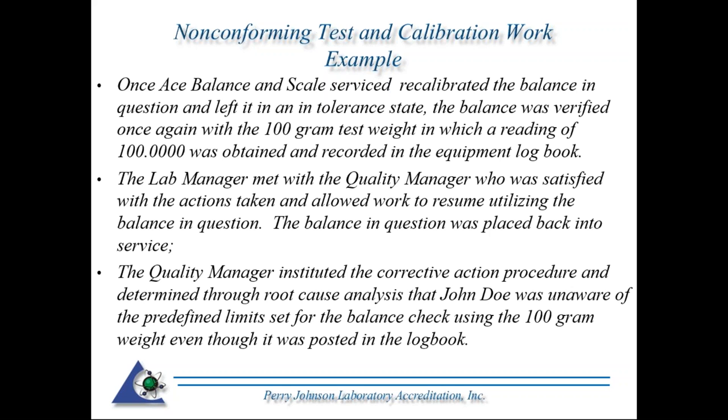The quality manager then instituted the corrective action procedure. In other words, in this particular scenario, this could happen again. Yes, we put a Band-Aid on the situation. We took the balance out of service. We had the calibration company come in. Recalibrated the balance.